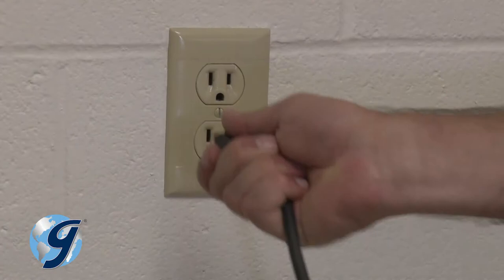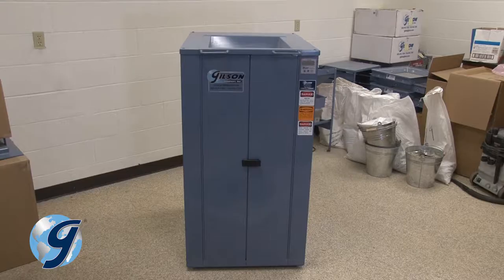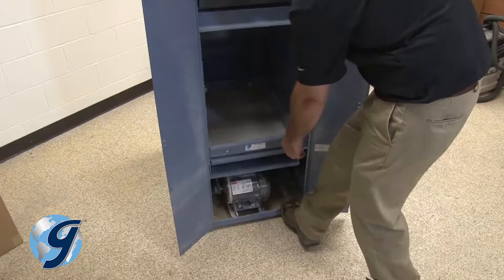First, unplug the unit from the power source and then unplug the power cord from the unit. Now move the TestMaster away from walls to allow sufficient room for working. Next, open the doors, remove any screen trays or pans and set them aside.